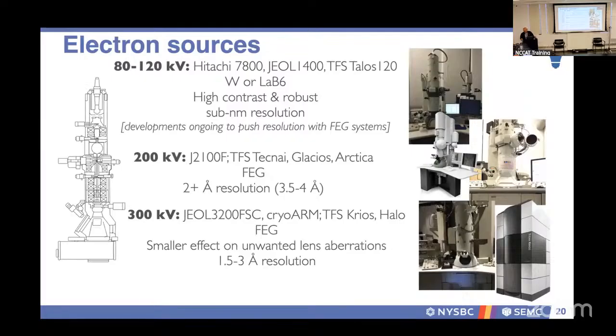I'm just wondering about the highest resolution you see. Well, we can get into the 2 angstrom range, but it really depends on the sample. I'm referring to apoferritin. Yes, you can get sub-2. Other places have gotten sub-2. We're not the Center for Apoferritin Research, so we're not really pushing that. If we wanted to, I'm sure we could get sub-2, but we would rather look at other things.